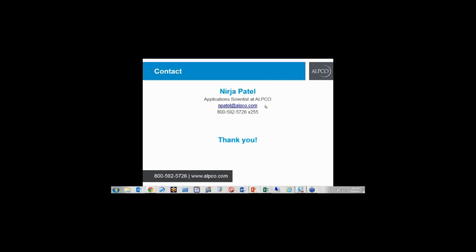I usually use cold buffers for that type of manipulation. The reason we're able to detect both of these antibodies in different colors using secondary antibodies is that one of the reagents is an IgM and the other is an IgG. So the secondary reagents are specific for mouse IgM versus mouse IgG. And ALPCO has the information for you on what those secondary reagents are as well, or the providers of those reagents.